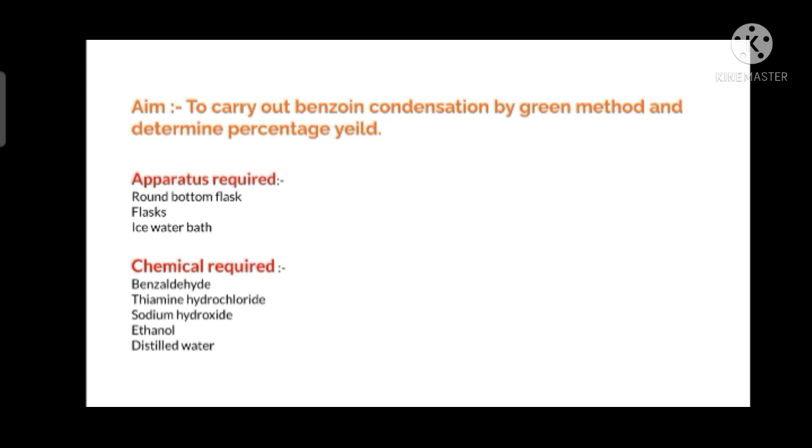The chemicals required are benzaldehyde obviously, then thiamine hydrochloride - this is the greener reagent we are going to use - then sodium hydroxide, ethanol, and distilled water. Now let us focus more on this experiment.